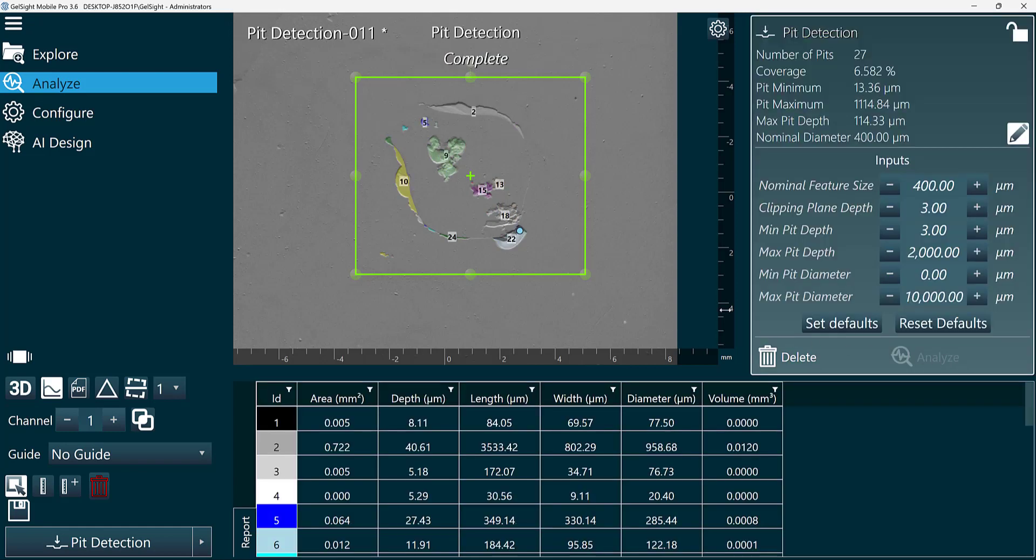So we just updated our nominal feature size, and now you can see it did group some of these smaller pits together as a single pit.